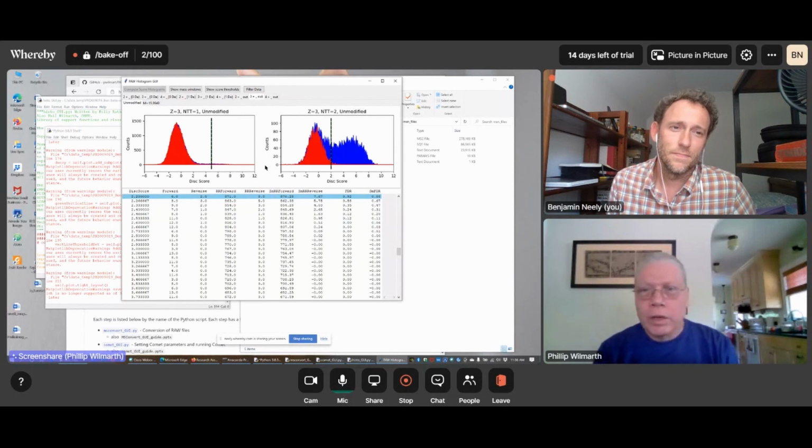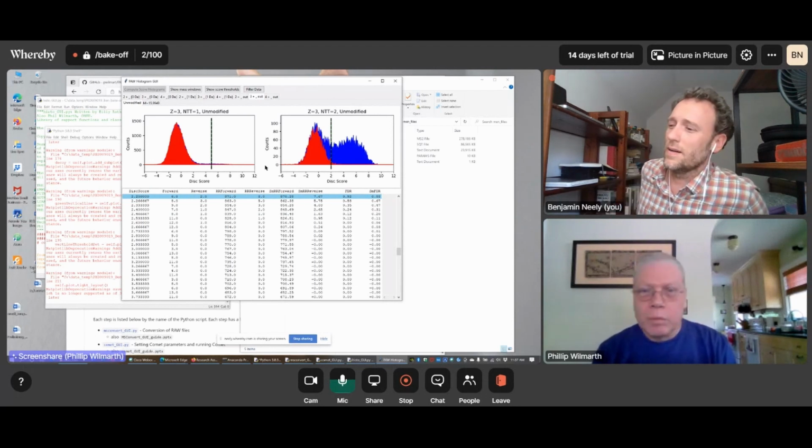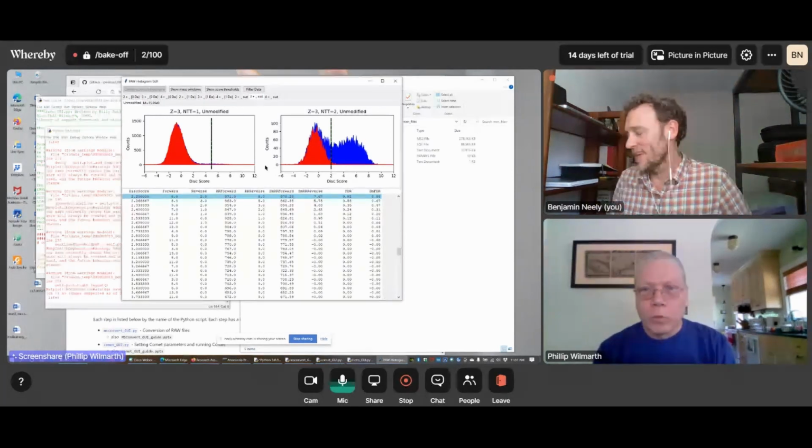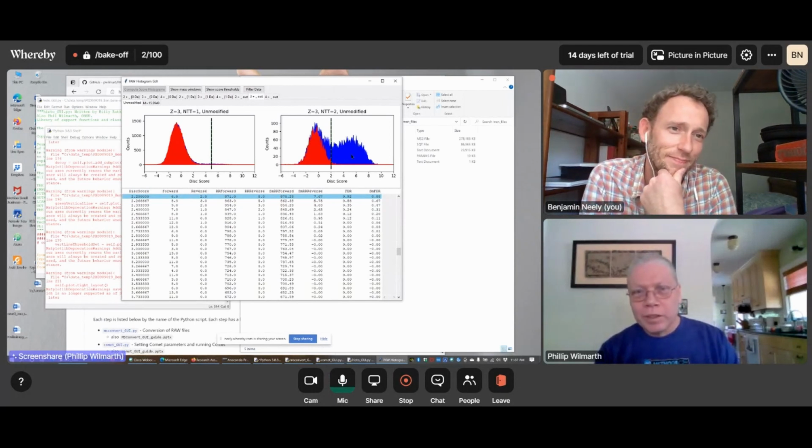And there's also another situation I think that occurs, where you may have a co-fragmenting peptide, and the co-fragmenting peptide may score better than the peptide the instrument had a monoisotopic mass for. So you might have a Comet search where the second peptide scores better, and that's what the identification is. But because that peptide doesn't match the monoisotopic mass, you don't get an accurate mass for it. So there may be some potential for second peptide IDs to cause some monoisotopic mass ambiguity. Whatever they are, they seem to be there, and they seem to have very clearly nice score distributions, well separated from the noise scores. So whatever their origin is, I do think they're good quality IDs.